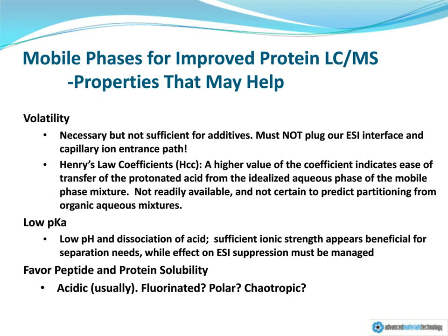As well, there's the consideration of, under what conditions do we get good ionization? Well, generally low pH. Neutral or elevated pH will give reasonable ionization for many, but not all proteins or peptides. And the collective experience is that certainly for reverse phase separations, there will be a considerable problem in peak shape and chromatographic efficiency.